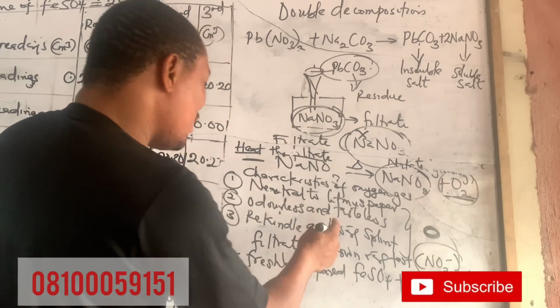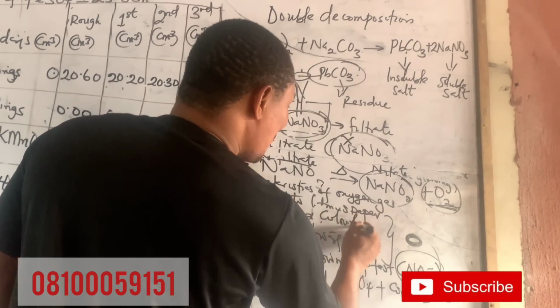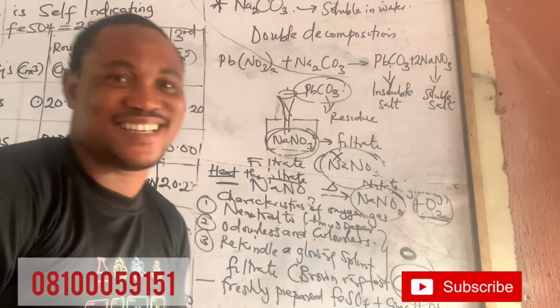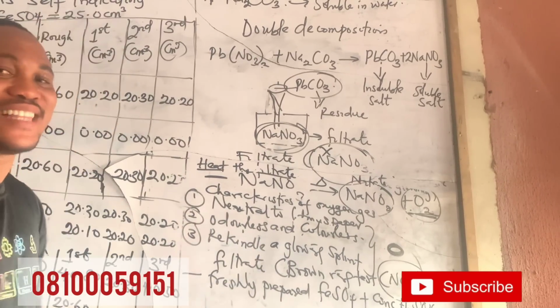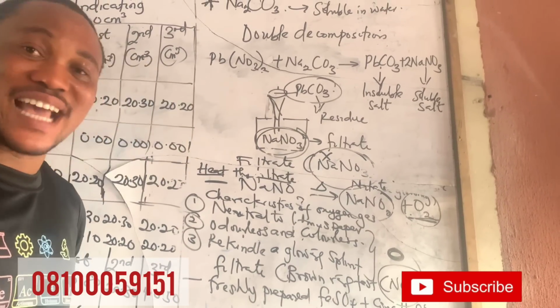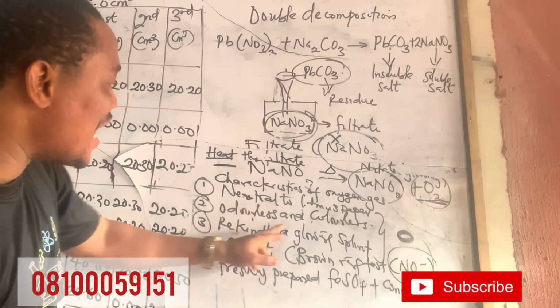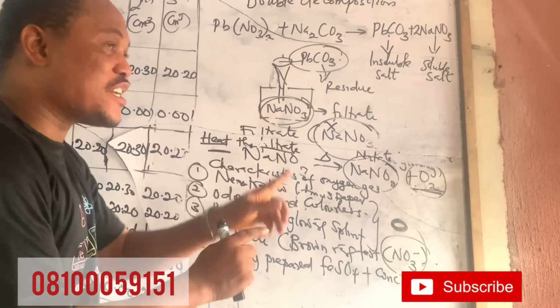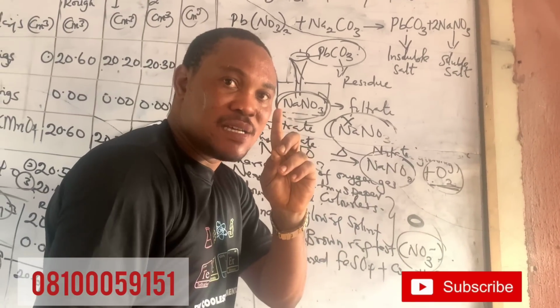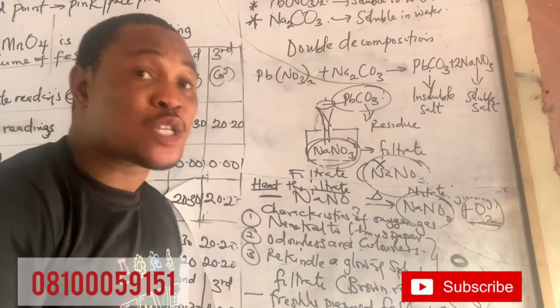Sorry, it's not tasteless. Who is tasting it? You want to taste the gas? So let me use odorless and colorless, please. Have you tasted it before? I've not tasted it before, so don't let me put tasteless. So, odorless and colorless gas. Immediately I see on that day that they said heat the filtrate, do you see that? That's the reason why if you are a very smart student, you can finish your number 2 without doing the test.